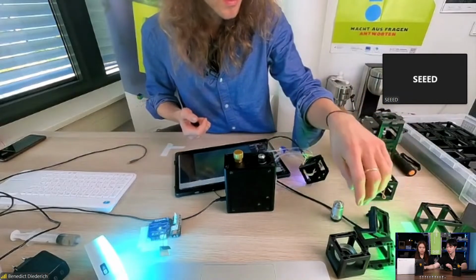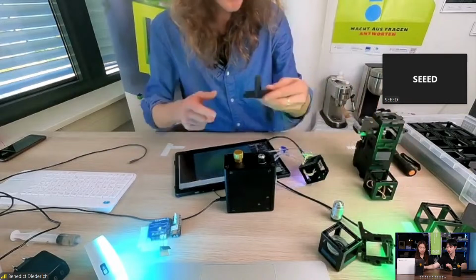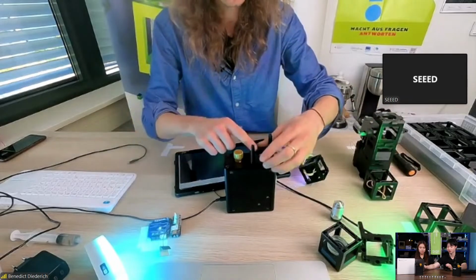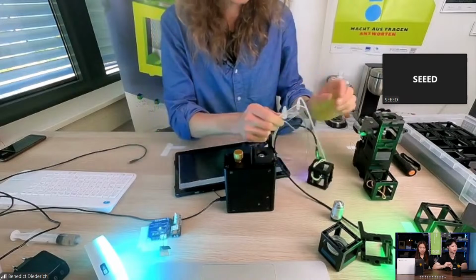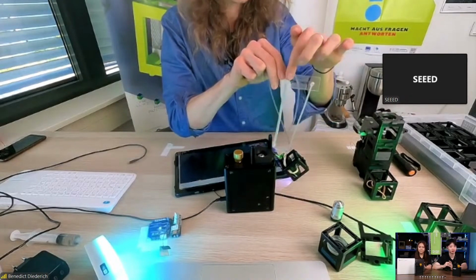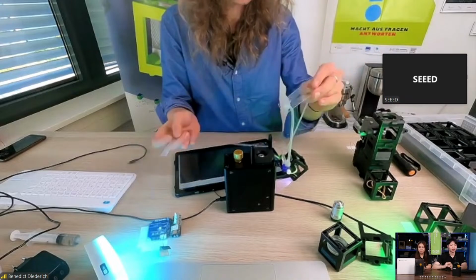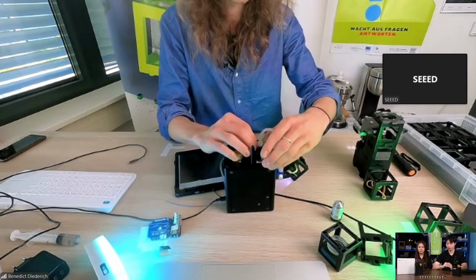Where did I put that now? So this is here. Yeah. So this is just the sample holder. And then I have to have this special sample. This special sample here has a little channel where the water is flowing through. And then we have to rotate that.